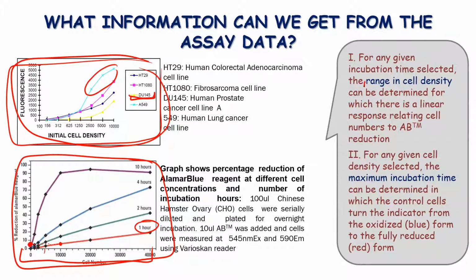In this case, of course, you want to understand the range in cell densities and how they behave in the incubation for this particular time point or time period. And second, you would want to know the maximal incubation time before your graph actually reaches the plateau.